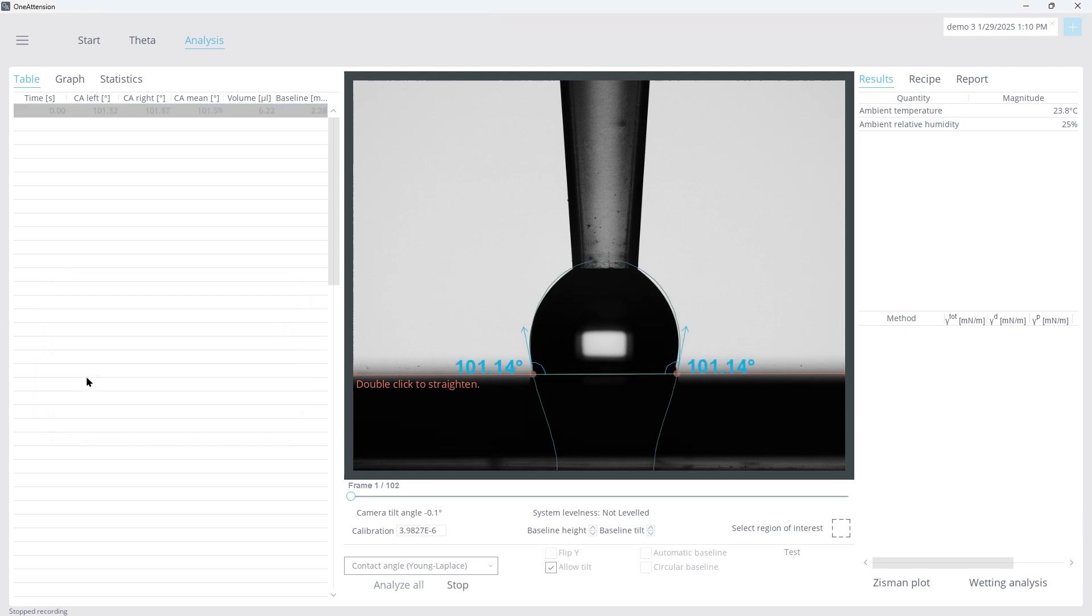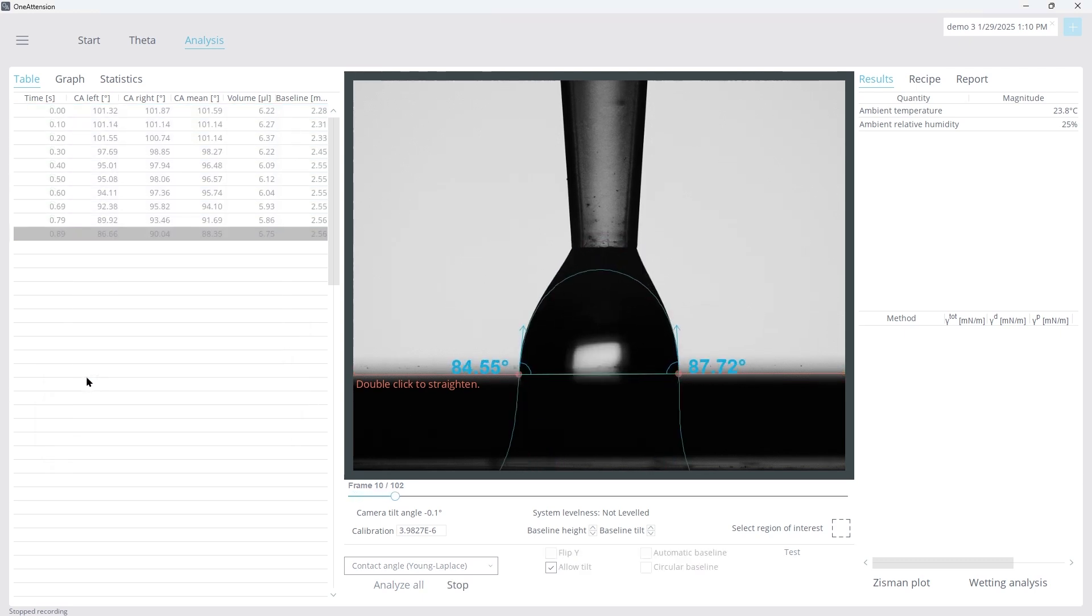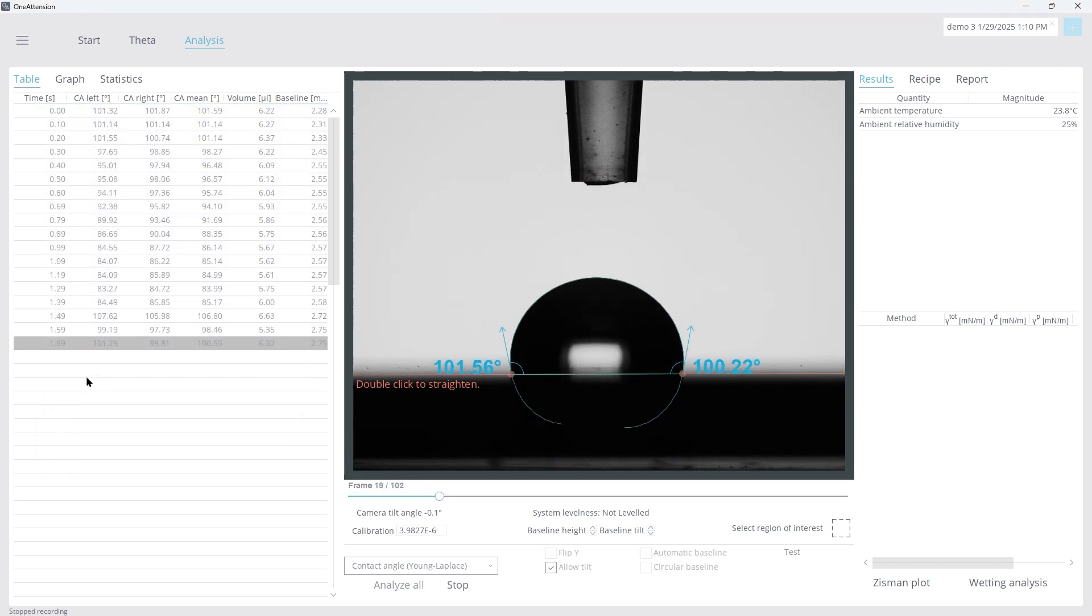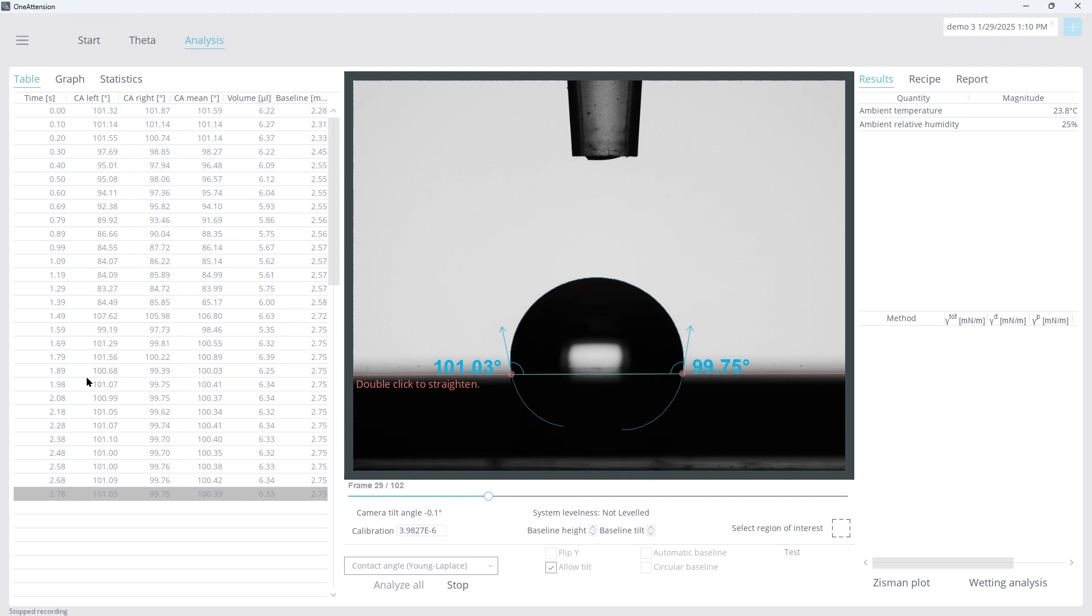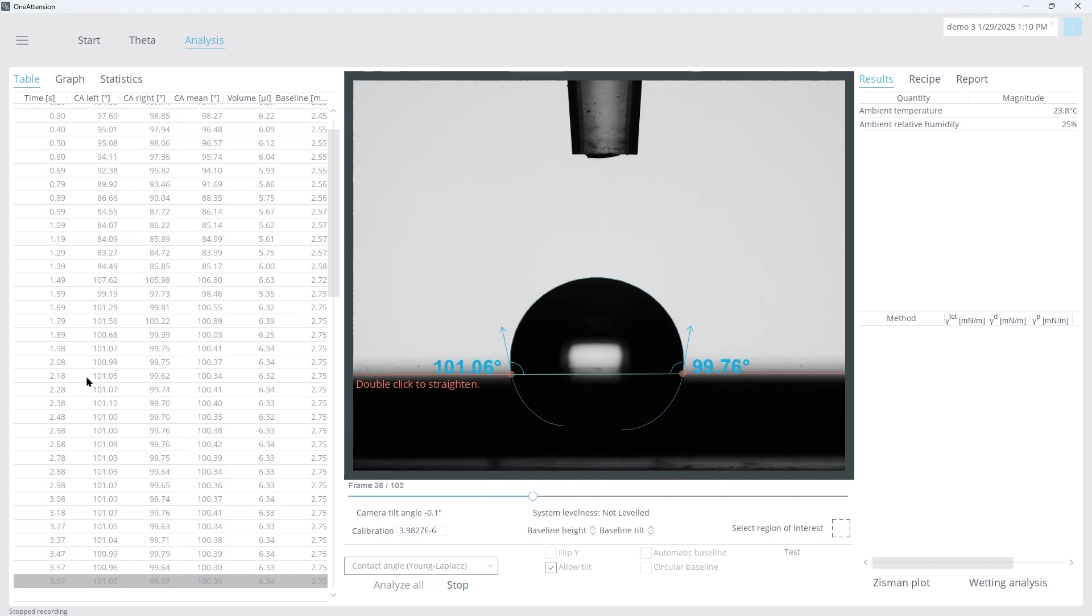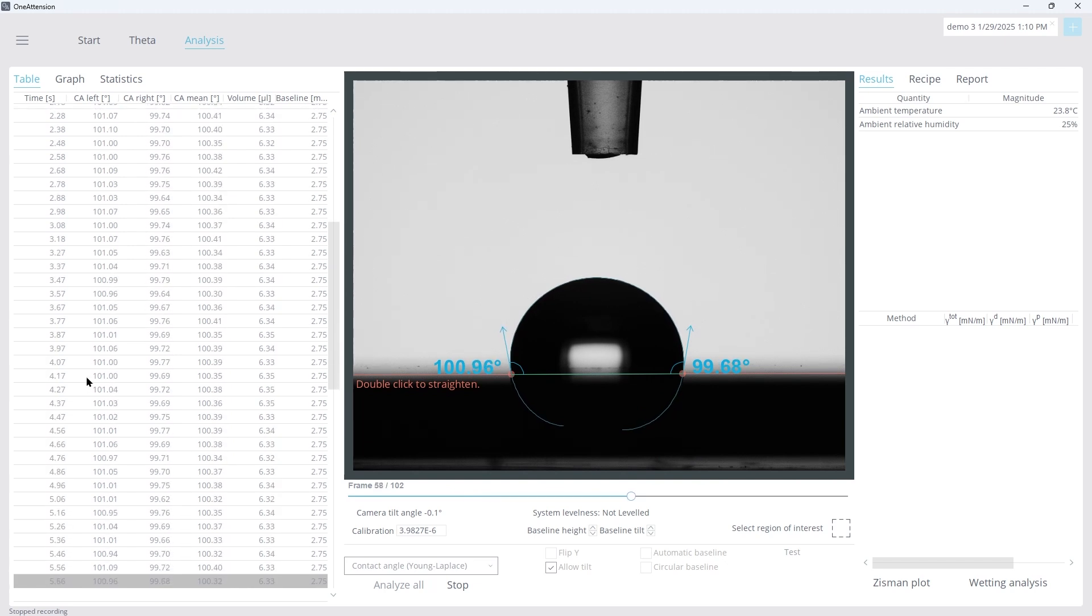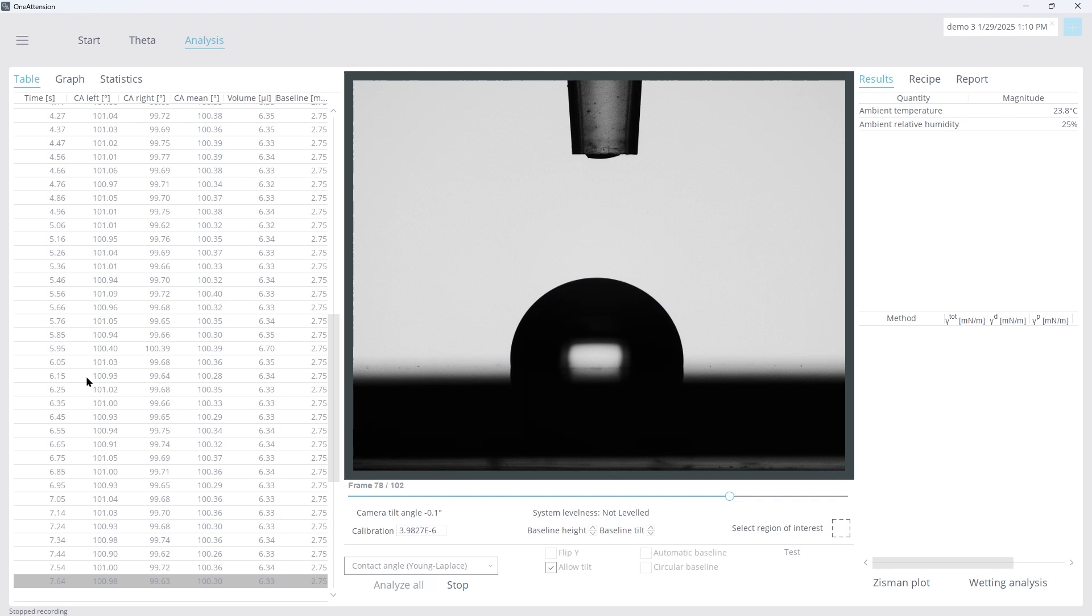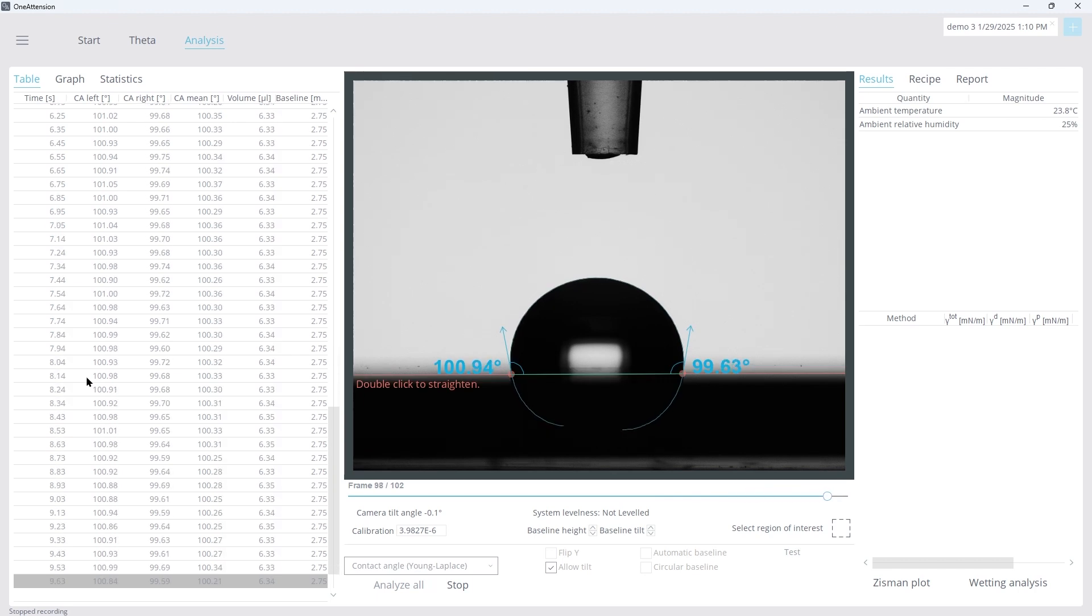The measurements are automatically analyzed in the left panel, where Smart Mode selects the most stable contact angles and averages them to provide the final contact angle measurement in the Results tab.